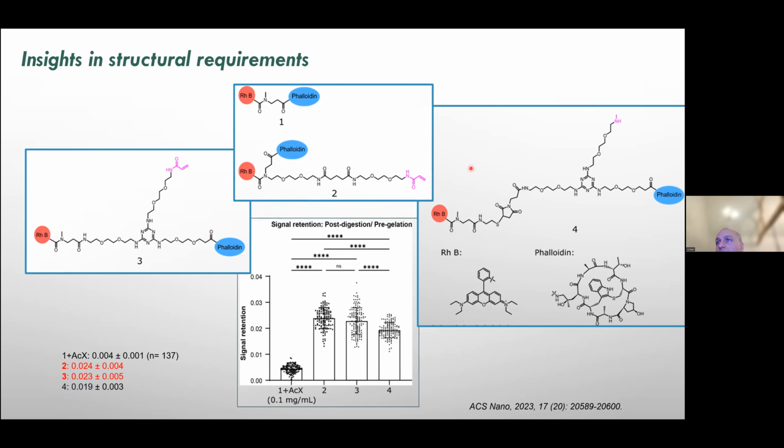And then on the right here, you see how we can start making things where you have a functional group, which is a maleimide, and your dye is only introduced at a later stage. This would be an easy way of making multiple linkers from one central molecule with a thiol addition to the maleimide.